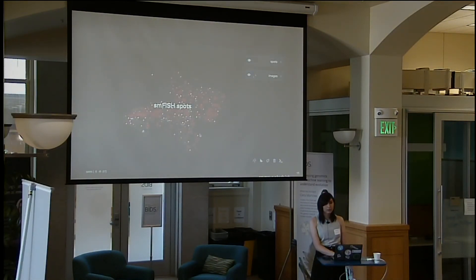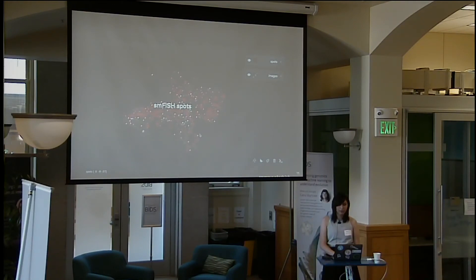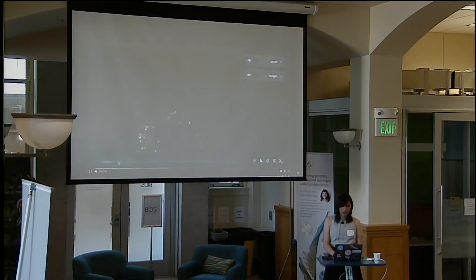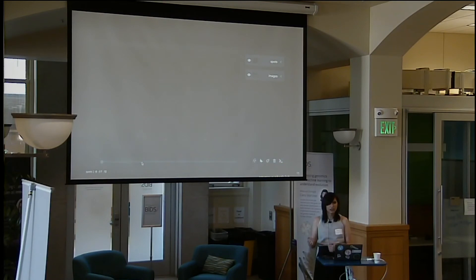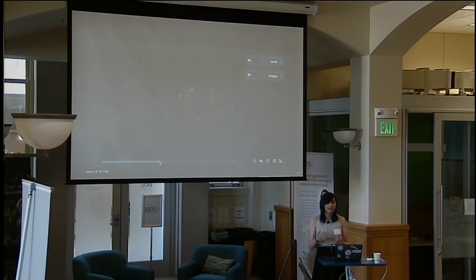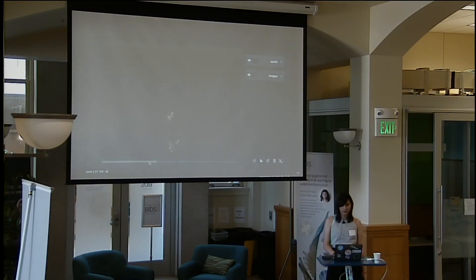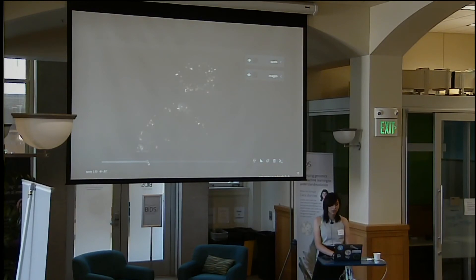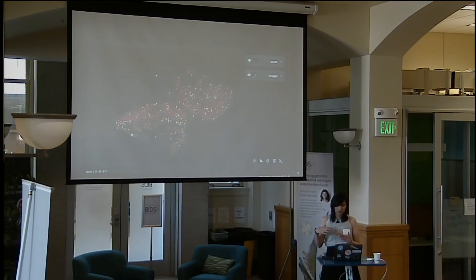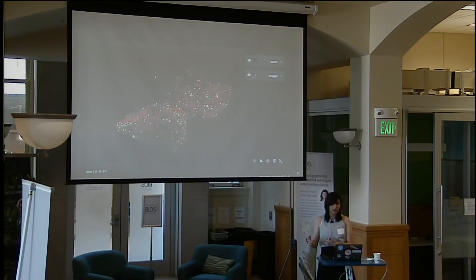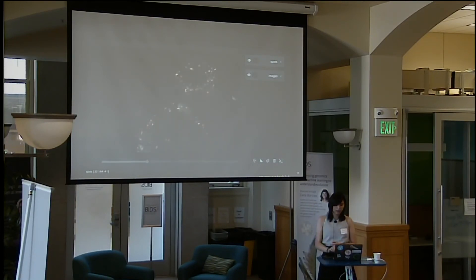Here are some smFISH spots from the Svoboda lab. This is a demonstration of our 3D rendering capabilities and some of our hotkeys, where we will be switching through the different viewed axes of the image. You can see in a moment here we are about to load into 3D mode.